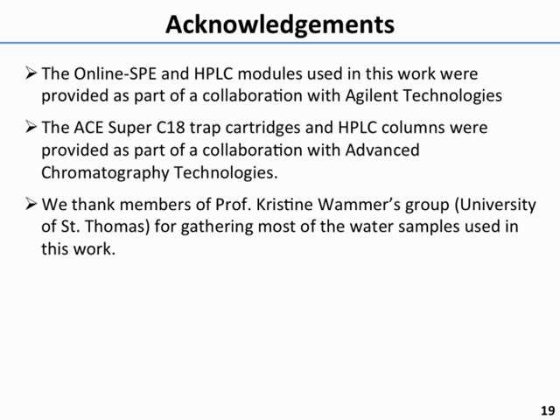Have you tried doing your recoveries without using EDTA? And if you have, what sort of recoveries? Is it necessary to add so much EDTA to your samples? I don't know that we've... the reason we started using EDTA is because that was what was published in the Analytical Chemistry paper. Yes.